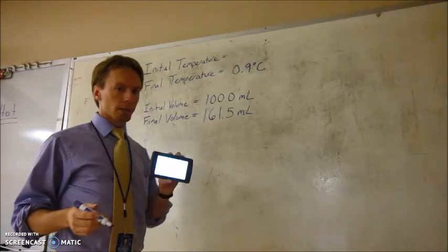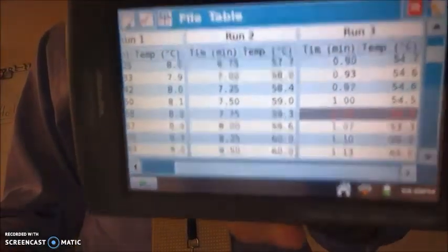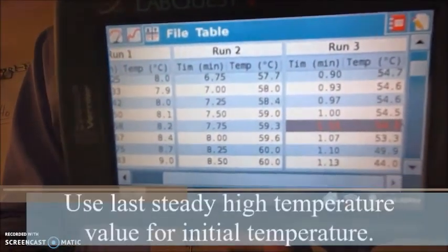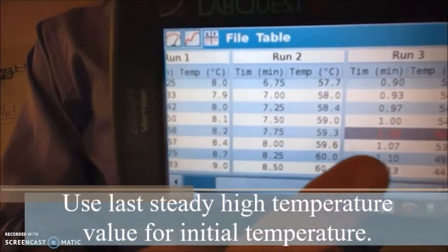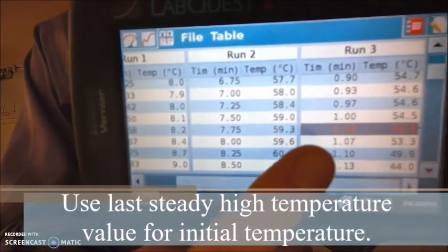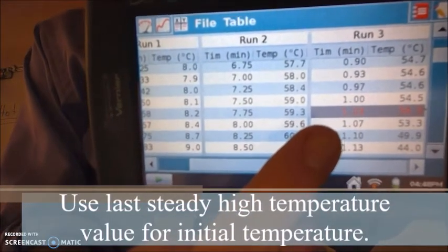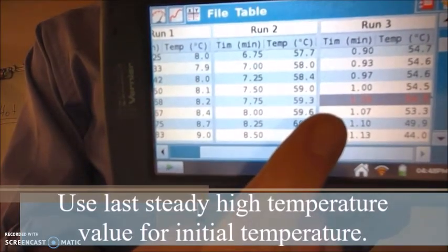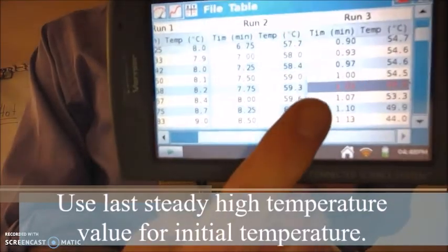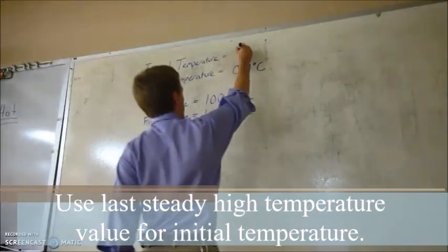So what you're going to do is go to your LabQuest and find the data that it uses to plot your results. And you're going to look for the temperature that's steady before there's a sharp decrease. So if I look over here, I have a temperature of 54.5, which I have highlighted there, and then it starts to go down pretty quickly, 53.3 at the next collection point, 49.9, and then 44. So I'm going to use 54.5 as my initial temperature.